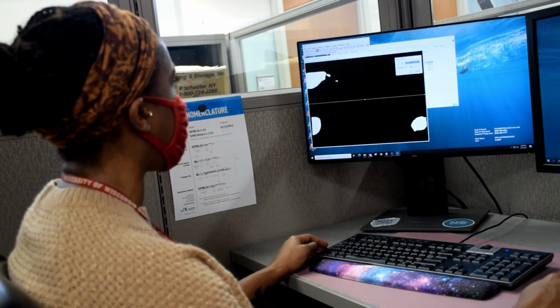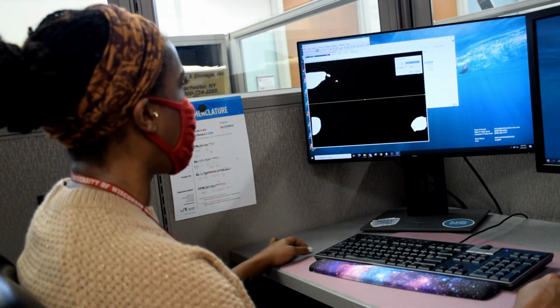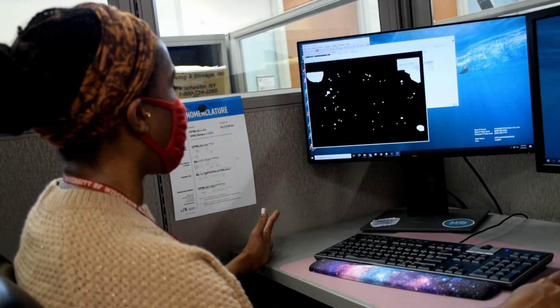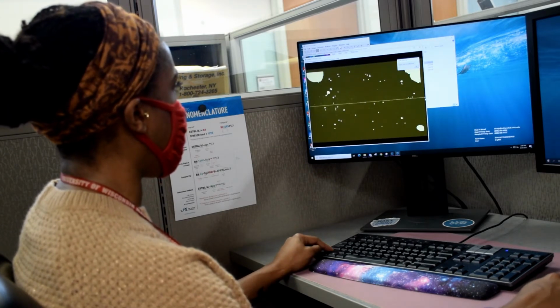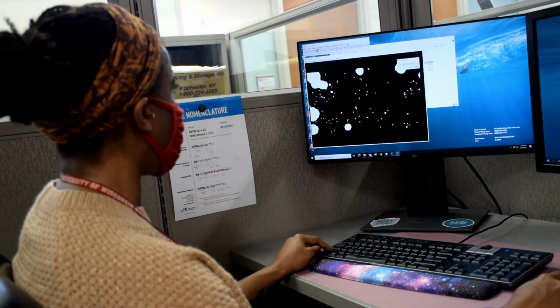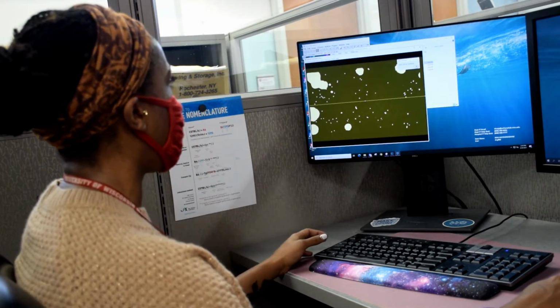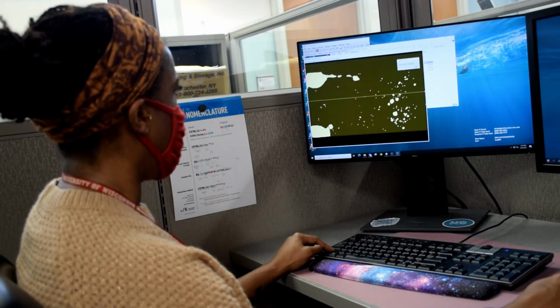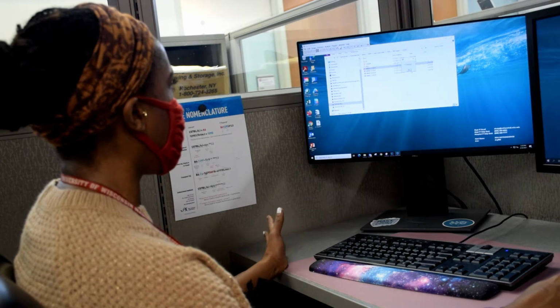And from here, we're going to select the width. So from the center of the image, how wide do we want it to select? In this case, we set it at 900 pixels. Then you're going to get a wide bar. It's going to do this for all of the images that we selected that were in the folder, and now you can see what that 900 pixel width looks like. It's going to automatically bring up each image, making sure that we have all the spots within that thick bar. Not quite in the middle in this case, so I could just bring it down. And now that we have everything, we click OK.